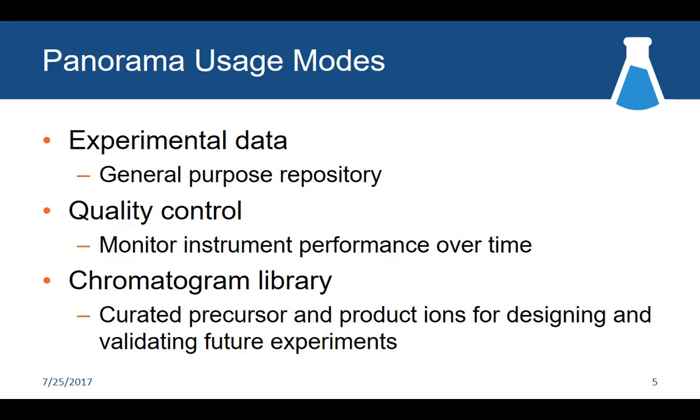And then the third is something that we developed pretty early on, didn't get a lot of traction, but then it seems to be getting some renewed interest at this point.